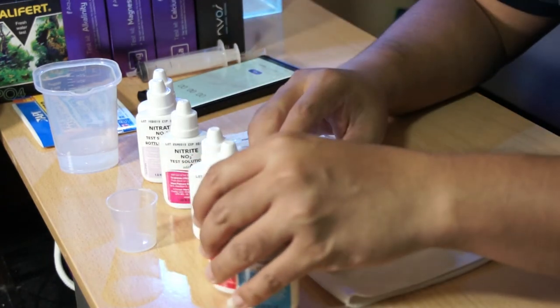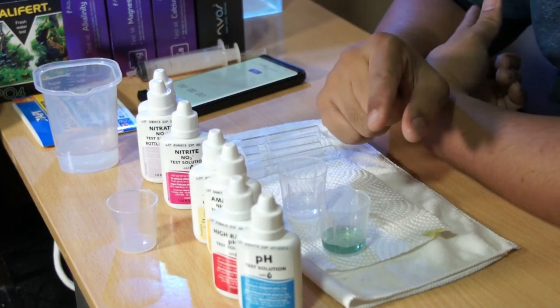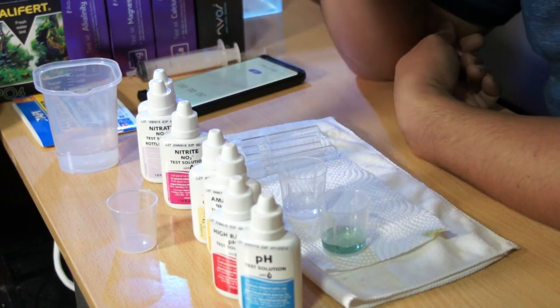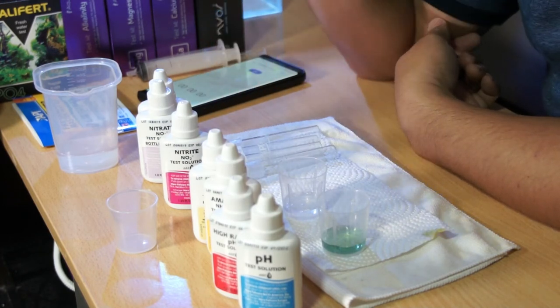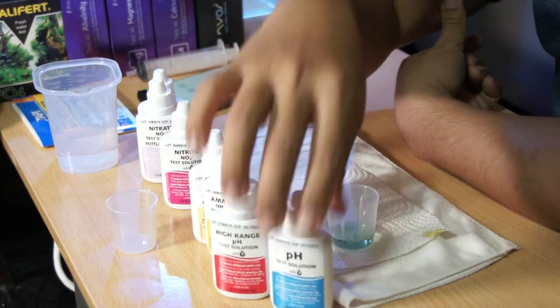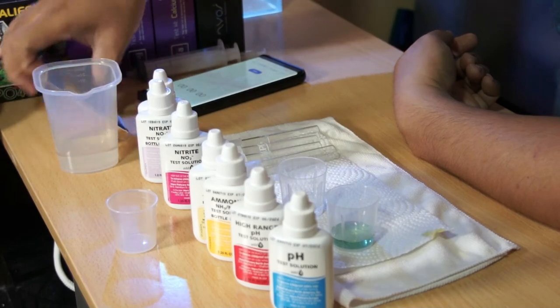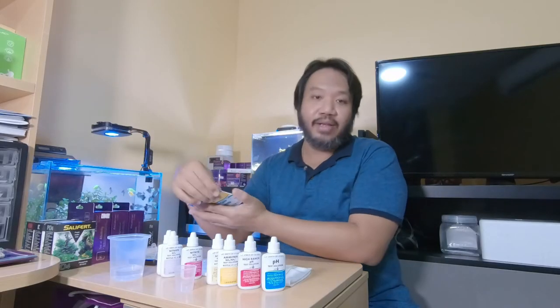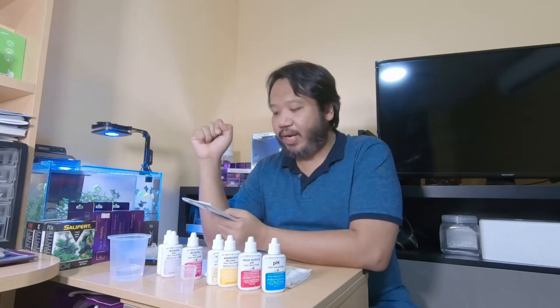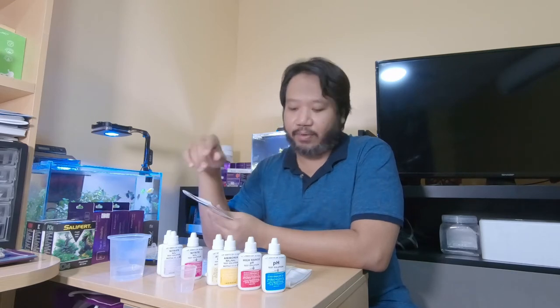Before we do the high range pH test, we may be able to predict it from the low range result. The high range pH test is for those who need readings above 7.6 — like for saltwater aquariums that need 8 to 8.6. The low range test goes up to 7.6; anything above that requires the high range test, which goes up to 8.8. For freshwater aquariums, if you're hitting 8.8, something is wrong.